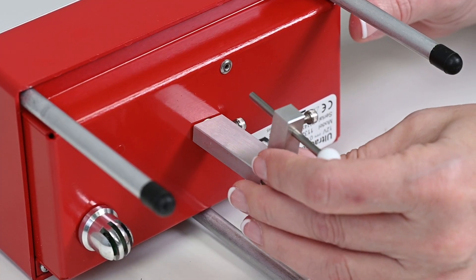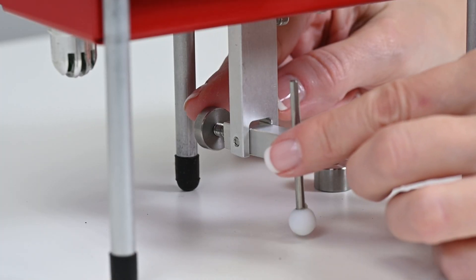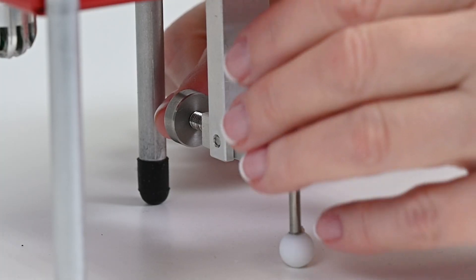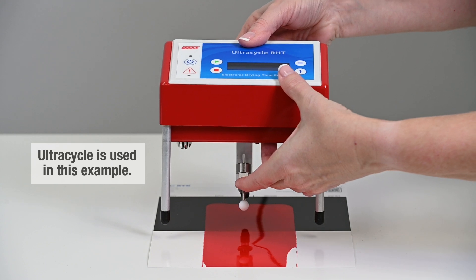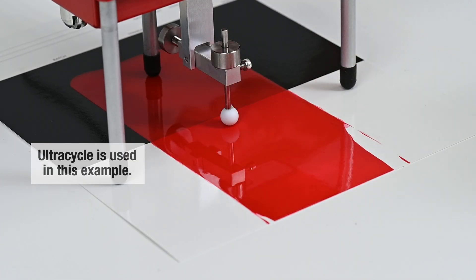Begin by attaching the arm and ball assembly to the motor shaft. Set the equilibrium by adjusting the rear counterweight before placing the 12 gram weight on top of the ball shaft. Place the drying time recorder over the freshly applied coating and lower the weighted Teflon stylus into position.